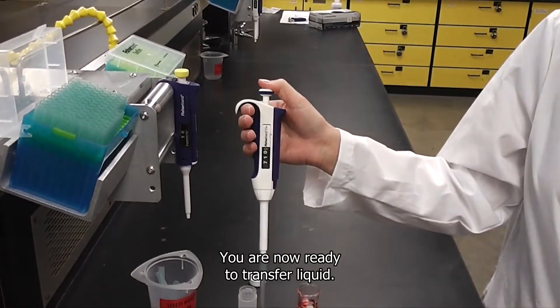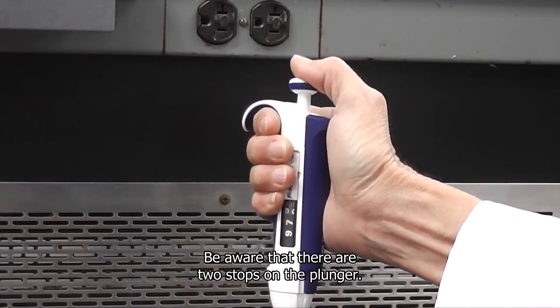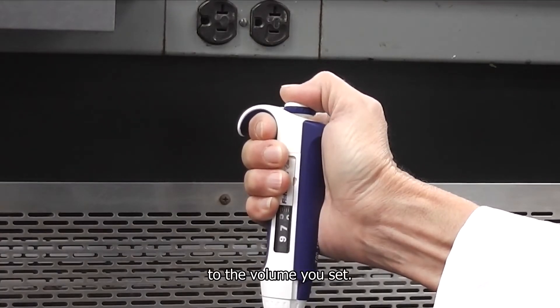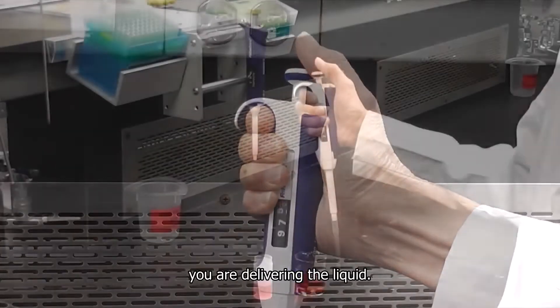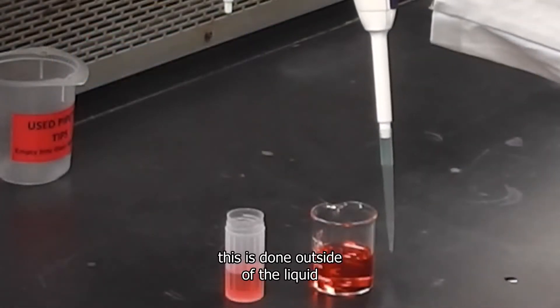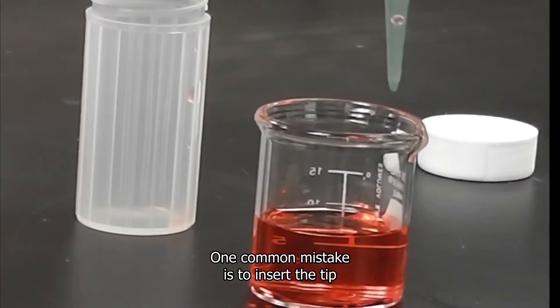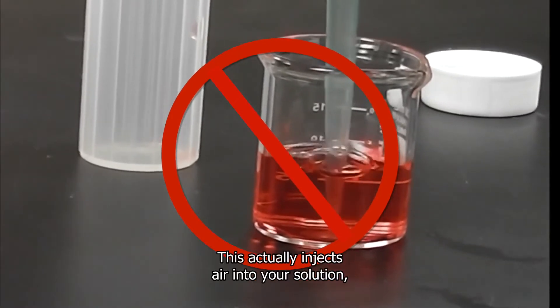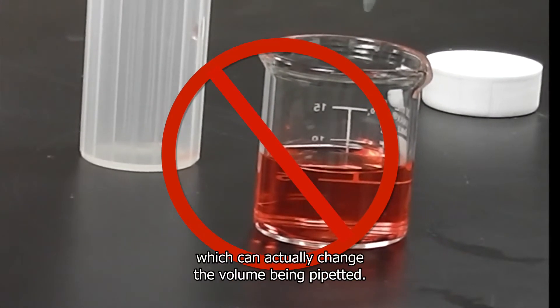You are now ready to transfer liquid. Be aware that there are two stops on the plunger. The first stop corresponds to the volume you set, and the second stop is used only when you are delivering the liquid. Depress the plunger to the first stop and hold it there — this is done outside of the liquid. One common mistake is to insert the tip and then depress the plunger, which actually injects air into your solution and can change the volume being pipetted.